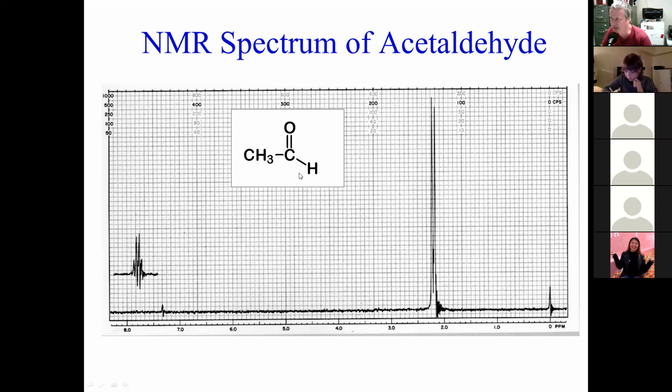It's a quartet. Why is this CH a quartet? Because how many neighbors does it have? Oh, 3. 3 neighbors. 3 plus 1, it's a quartet. See? Makes sense, right? That just kind of shows what this splitting looks like. Doublet, quartet, whatever. Okay?